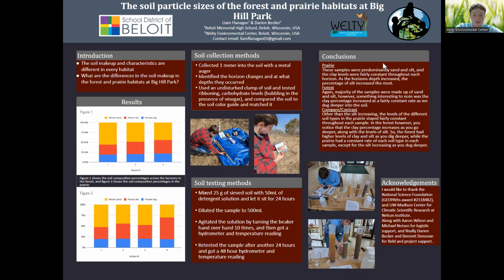My GEOPAths project is on the soil particle size distribution in the prairie and forest habitats here at Big Hill Park. To begin this project, I did some background research on soil particle size distribution and how it may vary across different habitats.